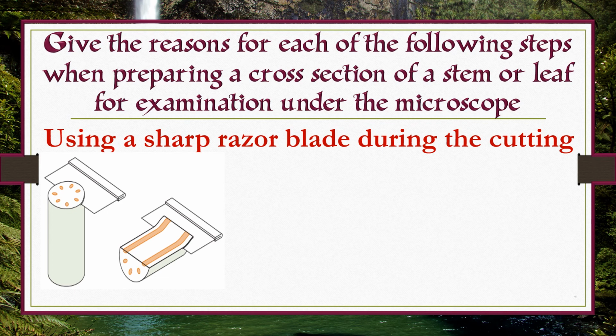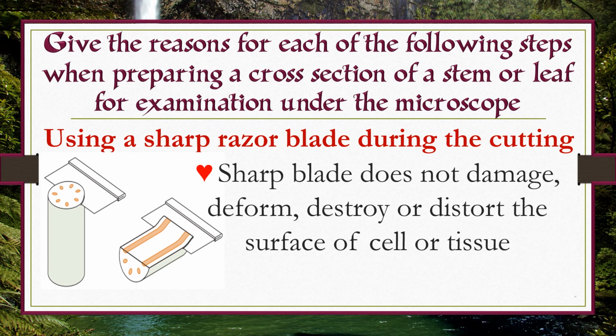A sharp blade does not damage, deform, destroy, or distort the surface of the cell or tissue. It also makes thin sections.